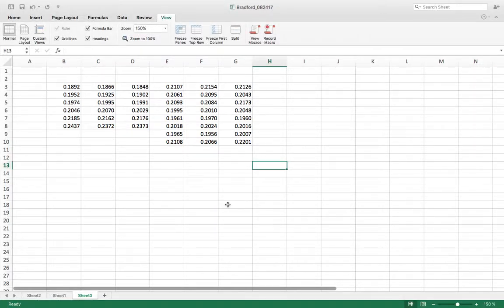Okay, in lab this week we're doing a Bradford test, or Bradford assay, and that's a test that we use to measure the amount of proteins. And as you're learning in class, proteins are the key functional unit of cells. DNA is transcribed into RNA, RNA is translated into protein. DNA and RNA have some functional role in the cell, but for the most part they just translate information.